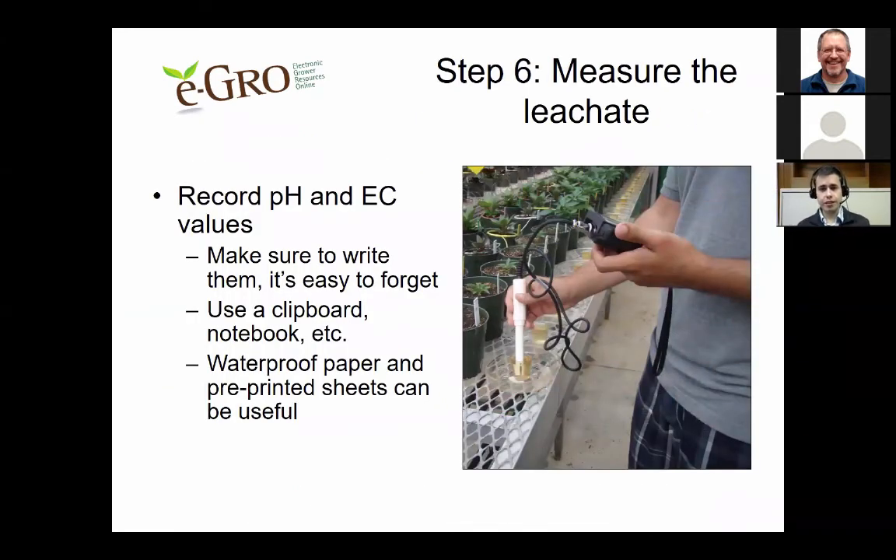In step six, measure the collected leachate with your pH and EC meters and record your values. It's really important that you write them down — it's very easy to forget. Have a clipboard or notebook handy, and consider investing in waterproof paper or printed sheets, because it's easy to accidentally spill leachate on your records.